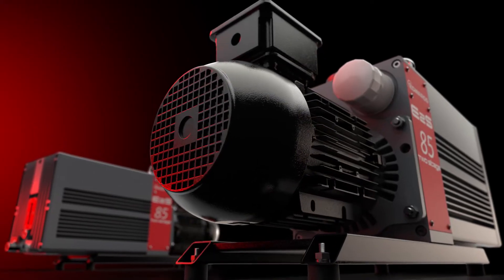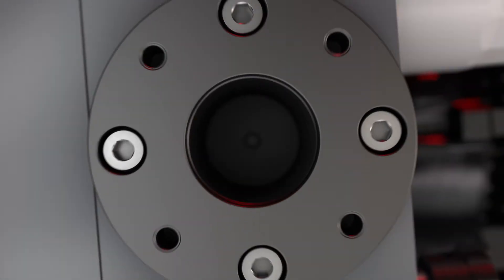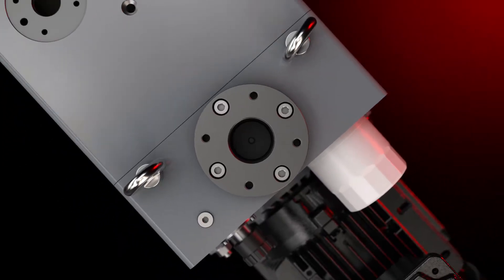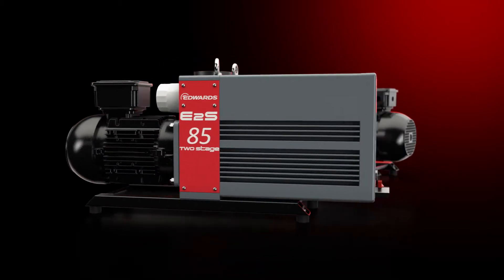Edwards' new E2S two-stage rotary vane vacuum pump. It's modern, it's versatile, it's reliable. But we're not here to tell you what it is — we want to focus on what the E2S is not.